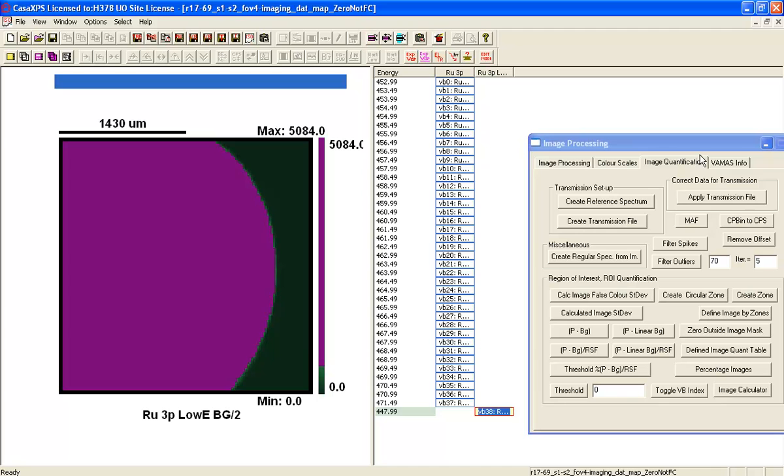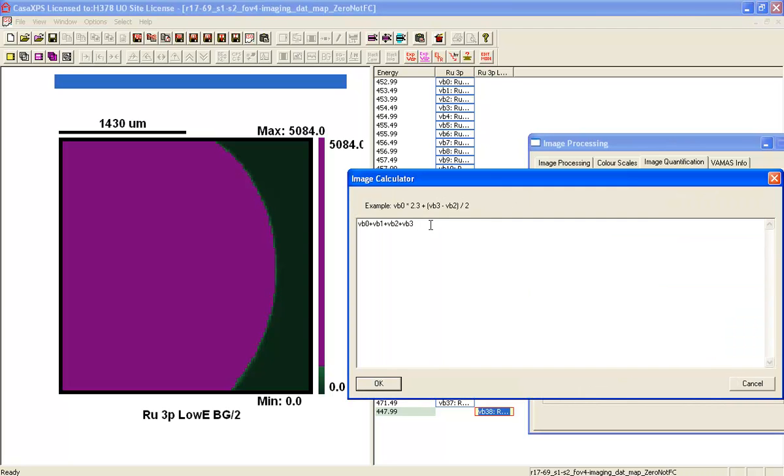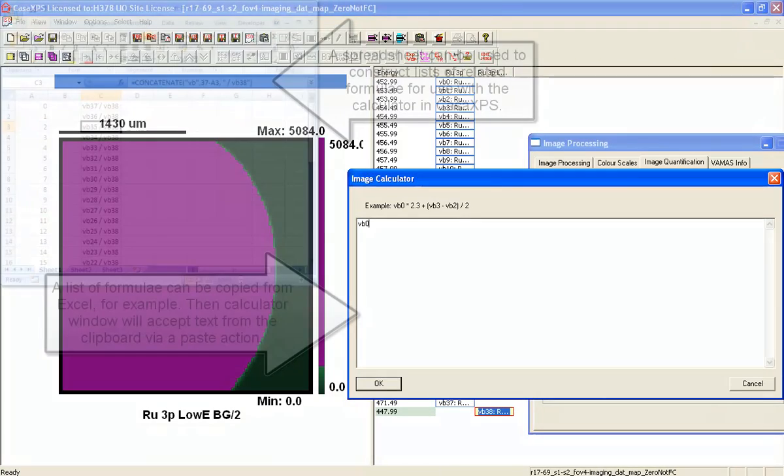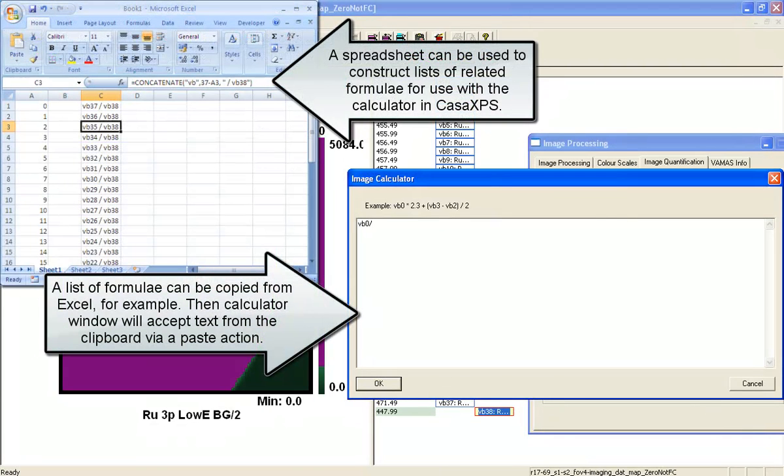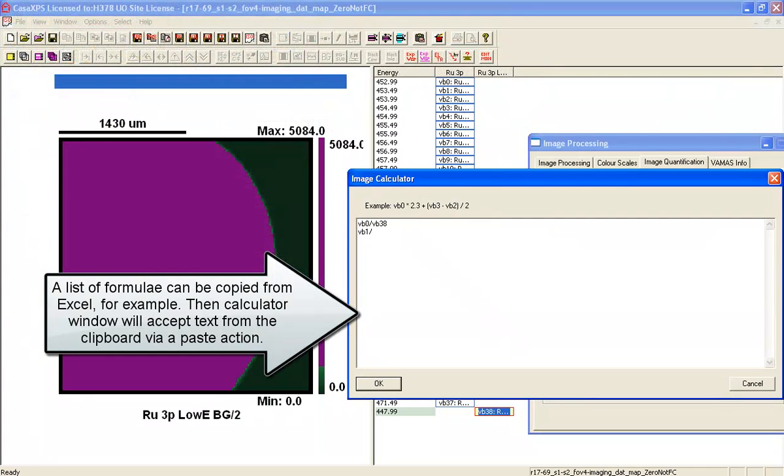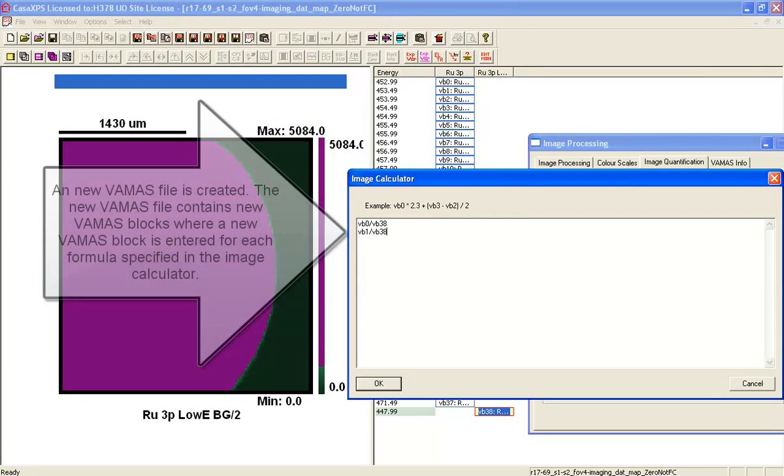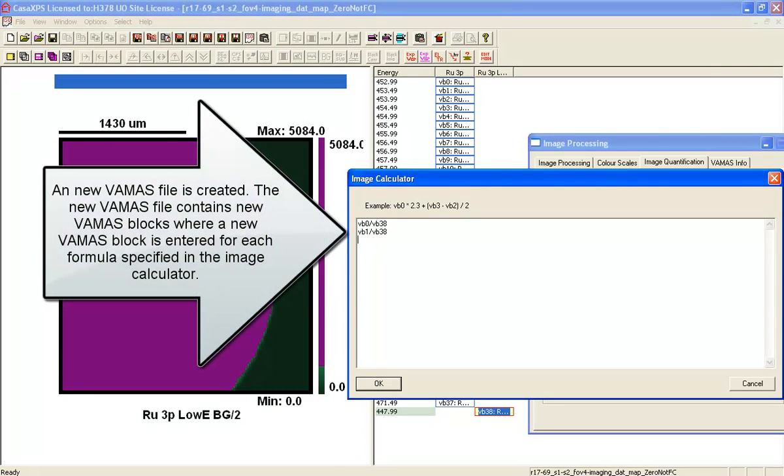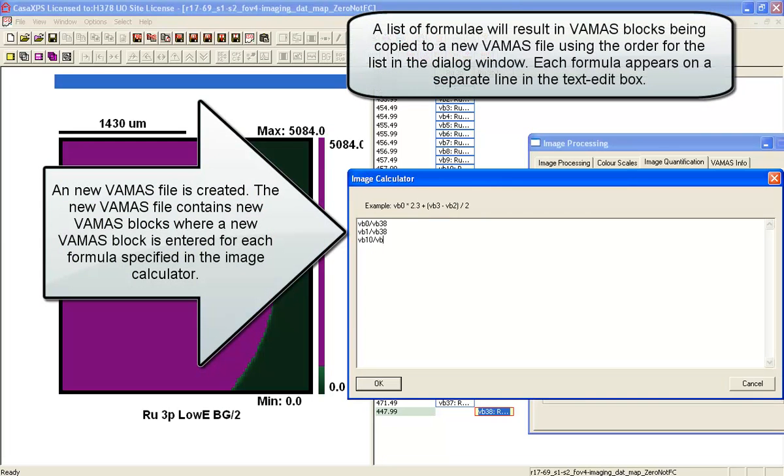So let's now use the image calculator. And instead of summing, what we'll do is we'll take VB0 and divide it by VB38 and VB1 and divide by VB38 and maybe VB10 and divide by VB38.